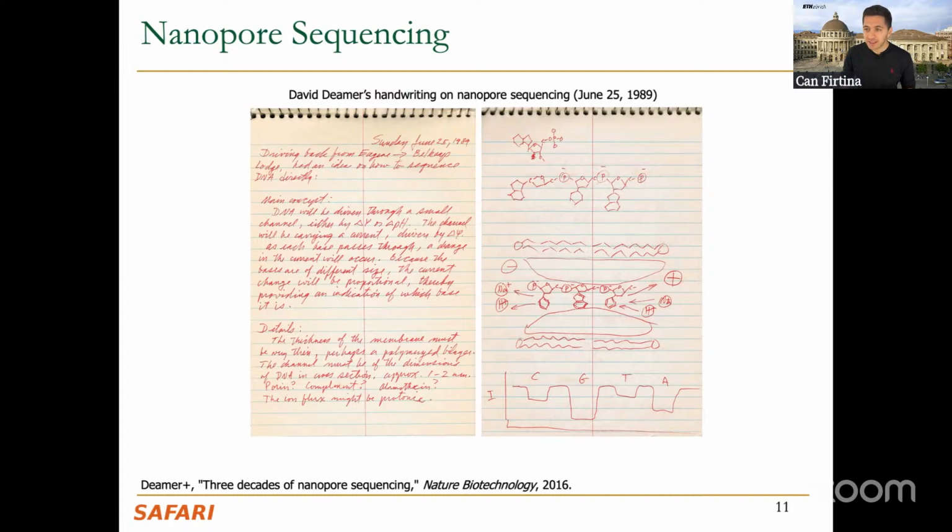Would it be creating a descriptive and disruptive change in the environment, descriptive enough for us to say, okay, this is the A that is now moving through that pore, because it is causing a disruptive change and also a descriptive change in the field? So this was the next question.